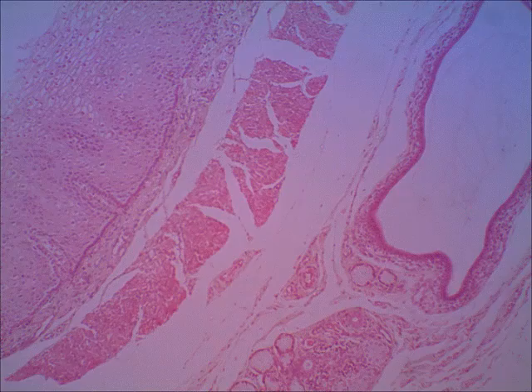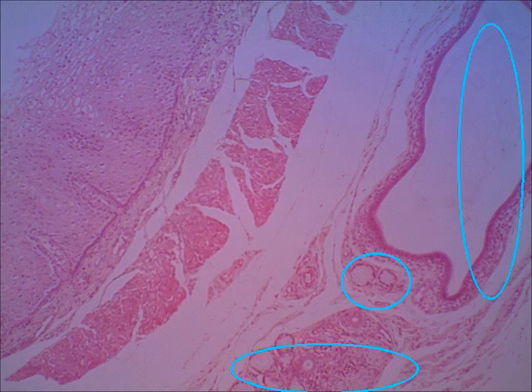Okay, if we move to another slide, still showing the esophagus, it's just a different view. Give it a moment to move. I don't know why this is so slow. Here we go. Now this is just another view on the same slide. It's not positioned exactly the same way, but you can see sections of the mucus gland right there, a little bit right there, and then this area, that would be a duct that is probably draining through. Over on the left-hand side of the screen, this is the mucosa. So you're seeing the stratified squamous epithelium. Okay, I think that will do it for esophagus slides.